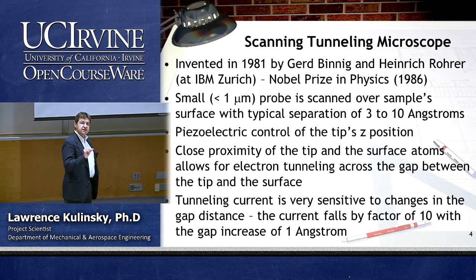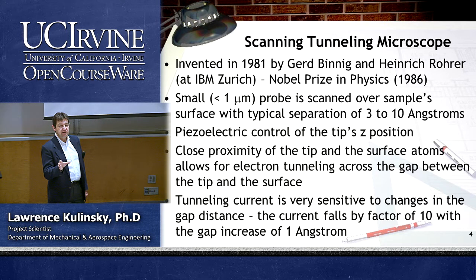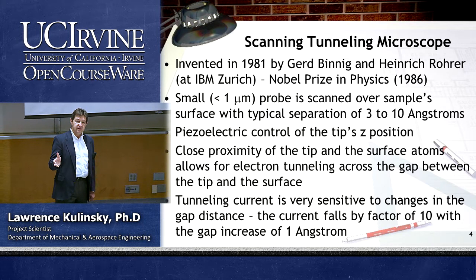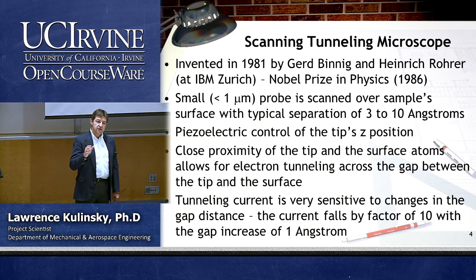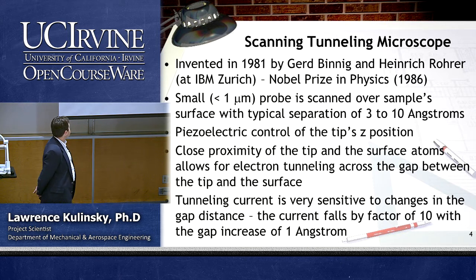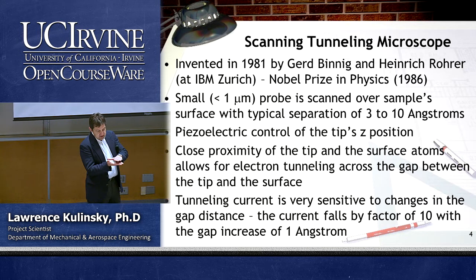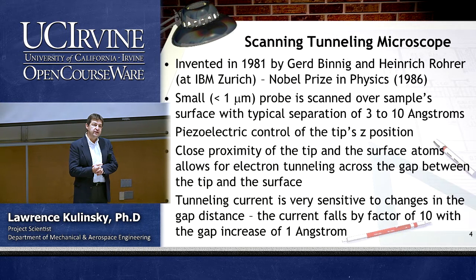So the key to this technique is the very finely tuned control in X, Y, and Z direction, and a piezoelectric stage is used. A piezoelectric material is a ceramic that changes its dimensions as you apply electricity. So close proximity between the tip and the surface allows tunneling. Tunneling is a quantum effect.